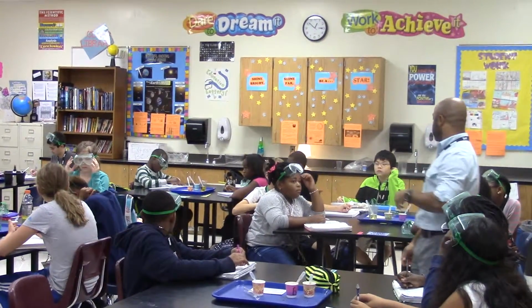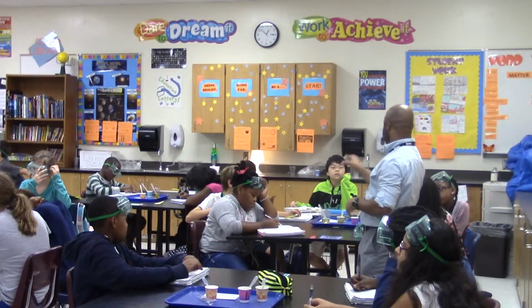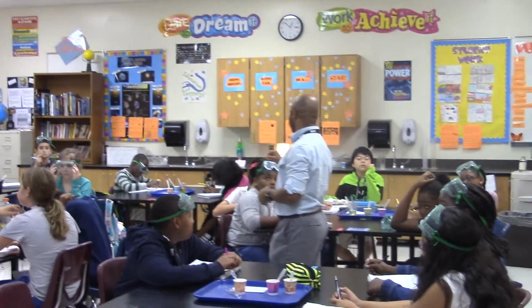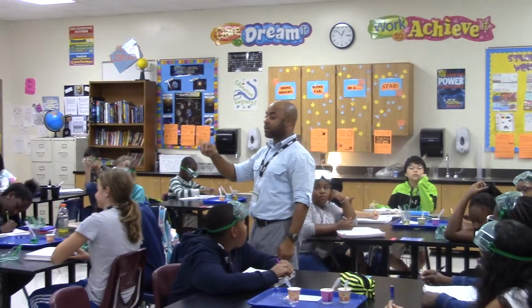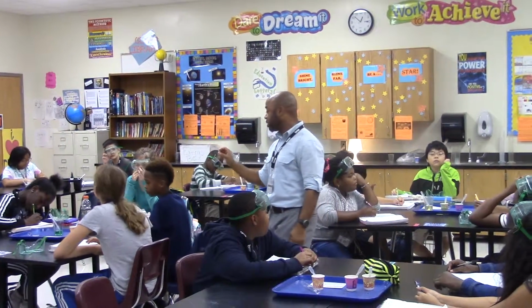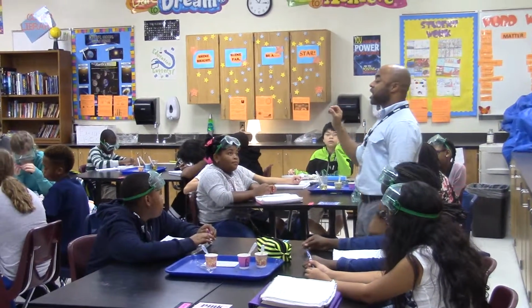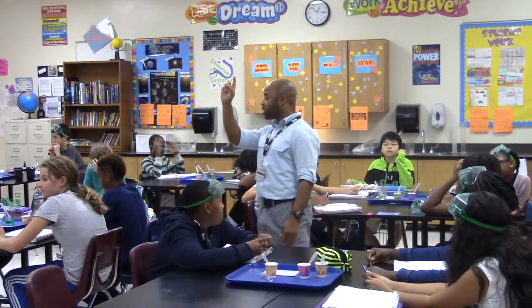Ben? Do you have to put down why? No, not why. We just want you to make a prediction. So you guys make a prediction, because based on what your prediction is, Nehemiah, that's going to determine whether, when you guys do it, you got it right. All right? So discuss as a group. Everybody should have the same prediction. So majority rules in this. All right? I'm going to ask you, as a group, what did you decide was the most dense and which was the least dense? That most dense is going to be the first one.